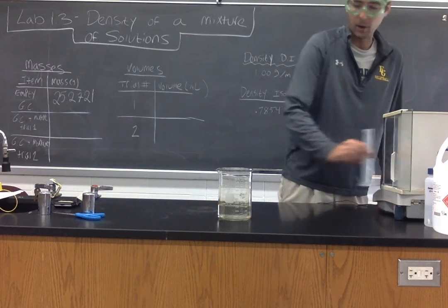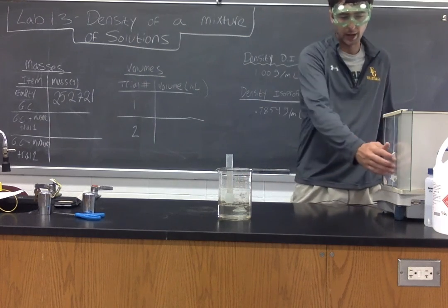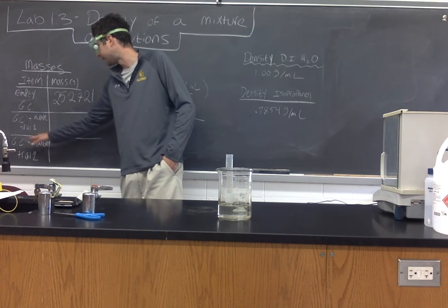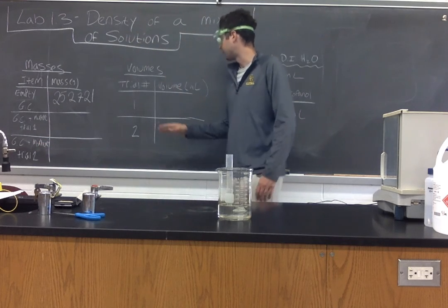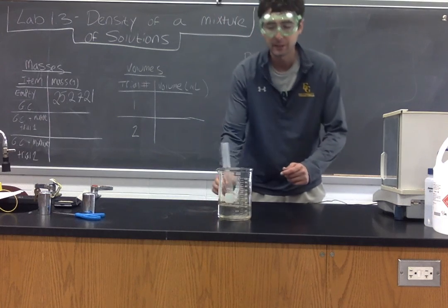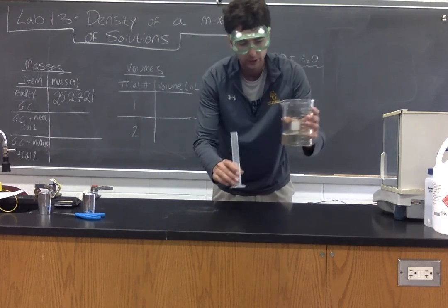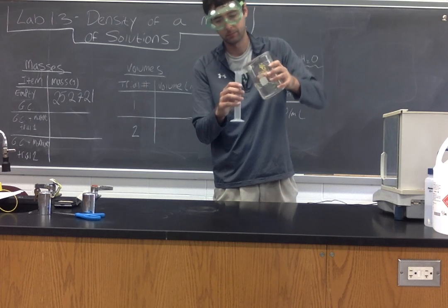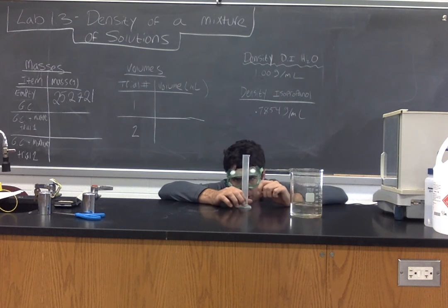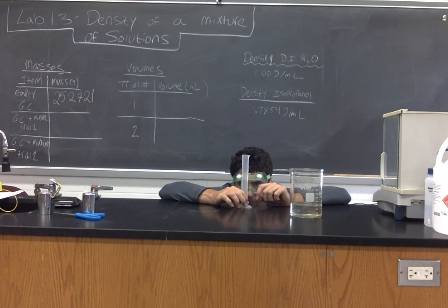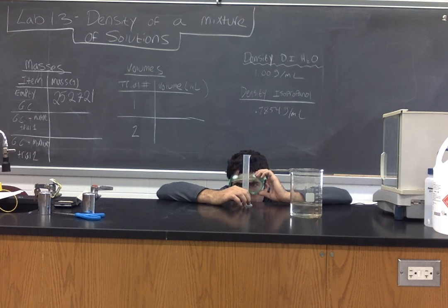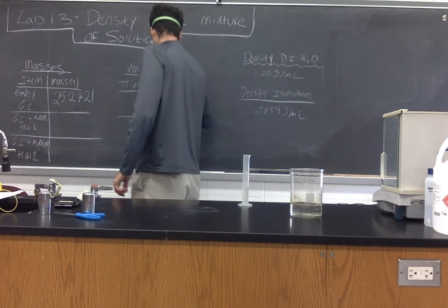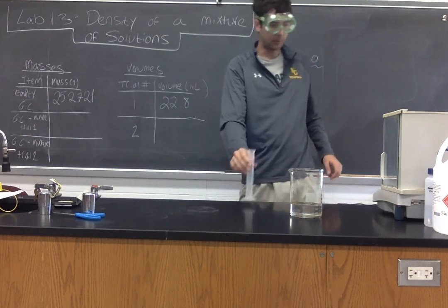Now at this point we are going to run our first trial. You can see the data table is set up for two different trials here. In the mass section, I'm going to have graduated cylinder plus the mixture for trial one and two. Now I don't have any specific volumes to test, so I'm just going to pour some of this mixture in here and we will record the overall volume. Get down to eye level and measure at the meniscus, and this is approximately 22.8 milliliters.